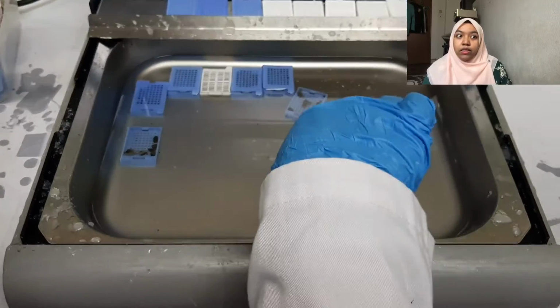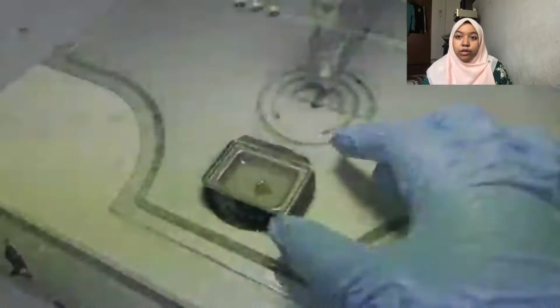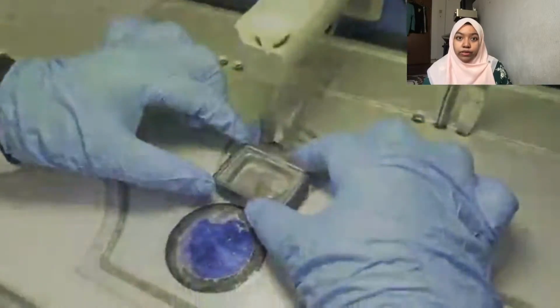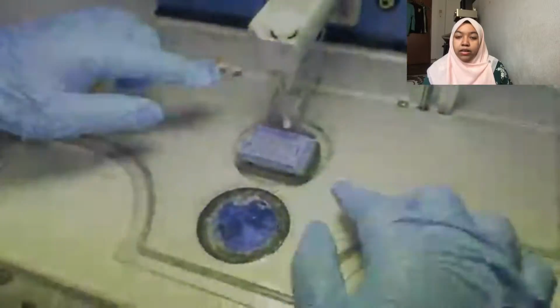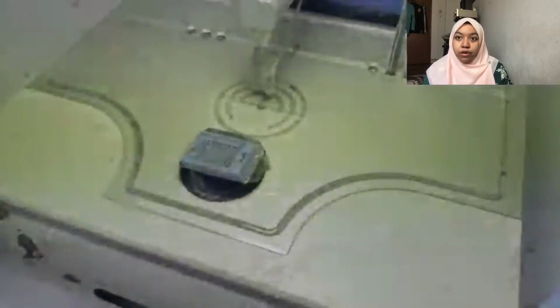First of all, a piece of tissue specimen that was left in a paraffin thermal unit was transferred into a molder by using warm forceps. Next, the tissue was embedded using the embedding machine, and once it's done with the embedding, the tissue paraffin block was frozen on the cold plate before the tissue is ready for sectioning.